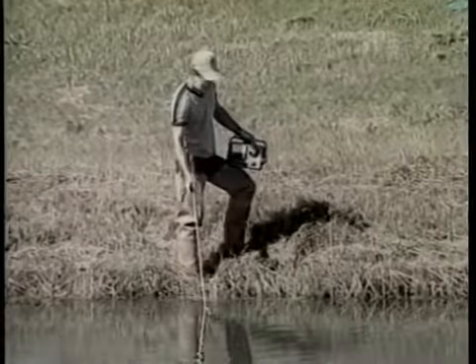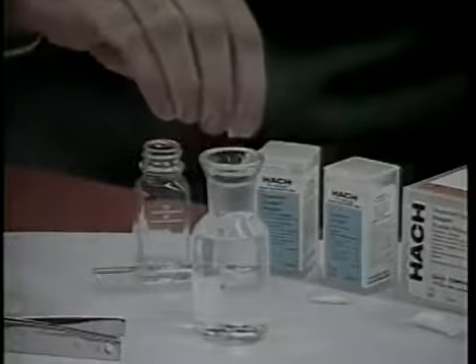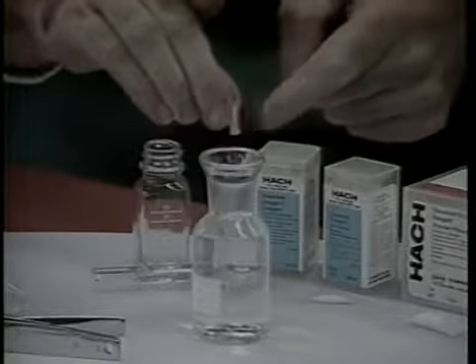Measurements of dissolved oxygen may be made with a portable oxygen meter or with a kit. The kit method is more time-consuming, but it is less expensive. For a description of testing methods and corrective measures regarding dissolved oxygen, see videotapes 2 and 3 in this series. To correct low oxygen levels, a variety of aeration devices are available. Each aerator is different in price and performance. To select the one best suited for your needs, contact your county extension agent.